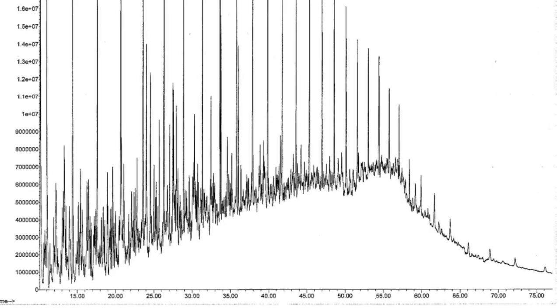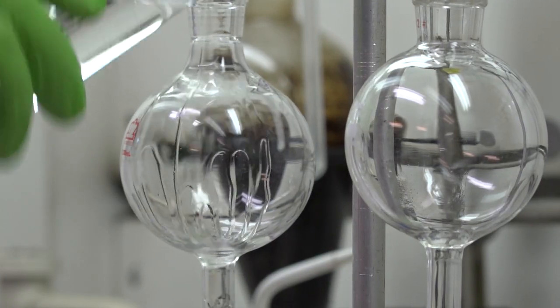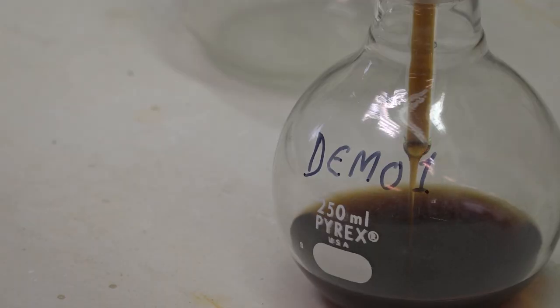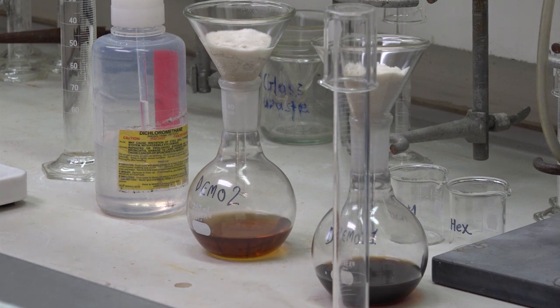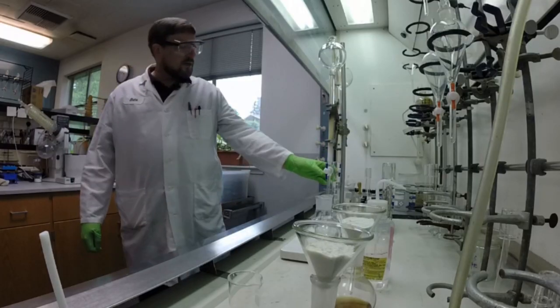In the same way that a thumb fingerprint is looked at visually, we look at the patterns that are created on the instruments, compare those patterns. The California Department of Fish and Wildlife's Petroleum Chemistry Laboratory helps determine the origin of oil spills, which can lead to criminal charges in California.